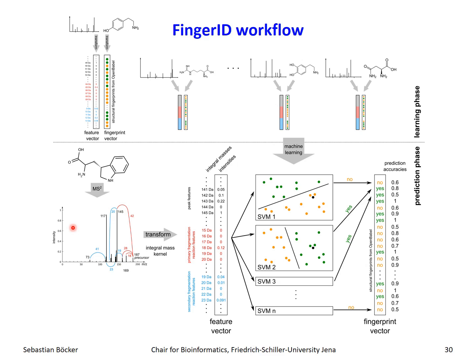But there might be something different, many peaks at 141 Dalton. We are using high mass accuracy data here. The cool thing is that we don't have to encode that for support vector machines. It's enough if we can somehow compute the similarity between different mass spectra, and that's very similar to the dot product. I'll come back to that in a second. For the moment, the workflow goes to the predicted fingerprint. We then compare that to all the candidates, and actually in the original FingerID paper, they used a weighting which was not so good. Without the weighting, it actually worked better. But we don't have to go into the details of that here.